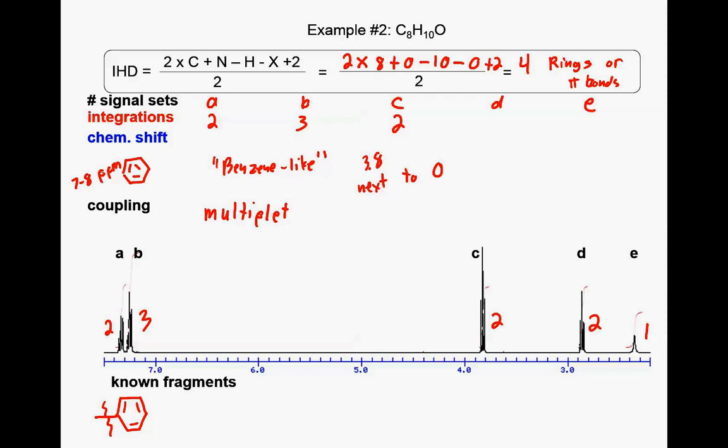All right, so what's the splitting on C? How many peaks do we see? It's not pretty, but I see 3 peaks, which would make it what? Yeah, that makes it a triplet. And so what this is indicating, all right, so our integration is 2. And so again, I like to start simple, and so the simplest way we could have 2 is we'd say, all right, we've got a CH2, and it's split into a triplet.